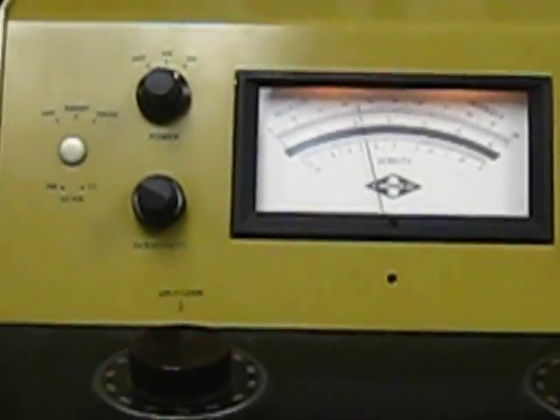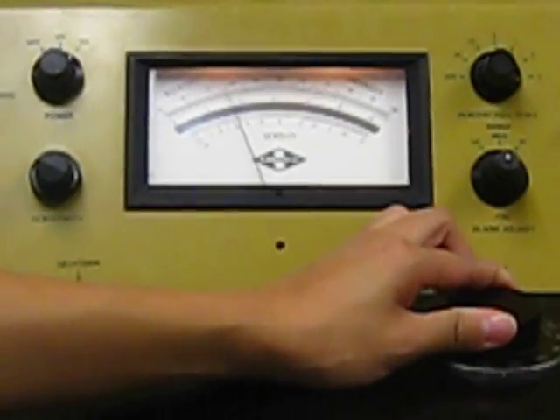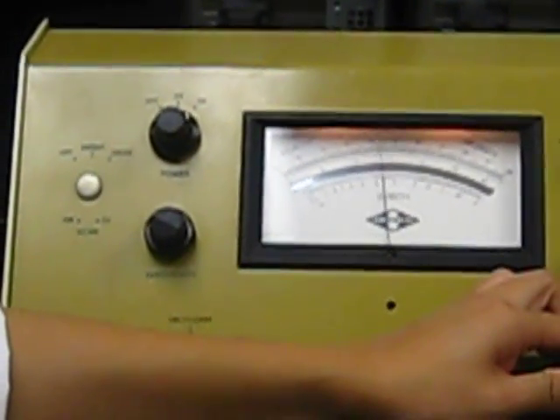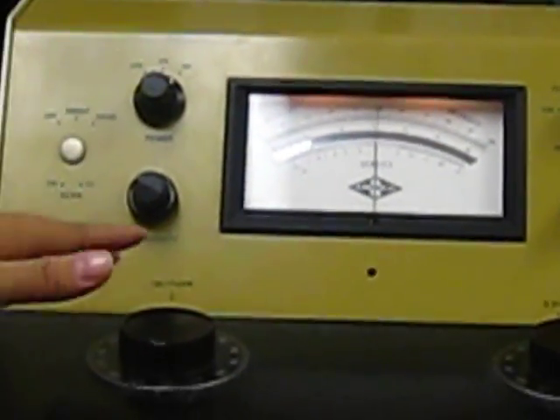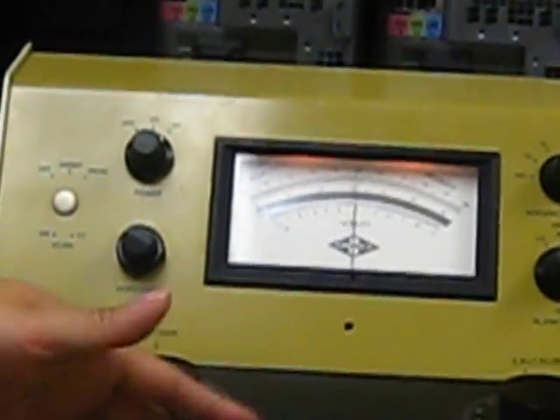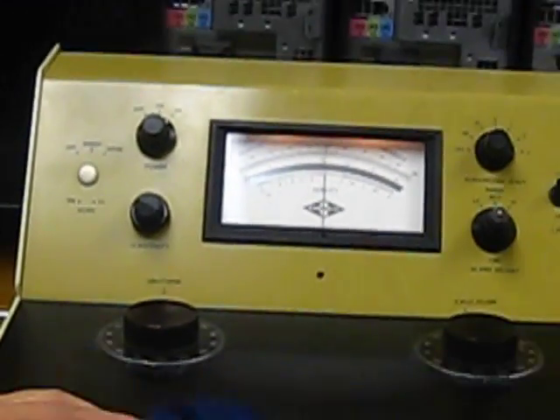Once we get the maximum emission wavelength, we will change the excitation wavelength until we get the maximum excitation wavelength. Okay, now we get the maximum excitation and emission wavelength. We can remember all these figures, then we will begin our measurement.